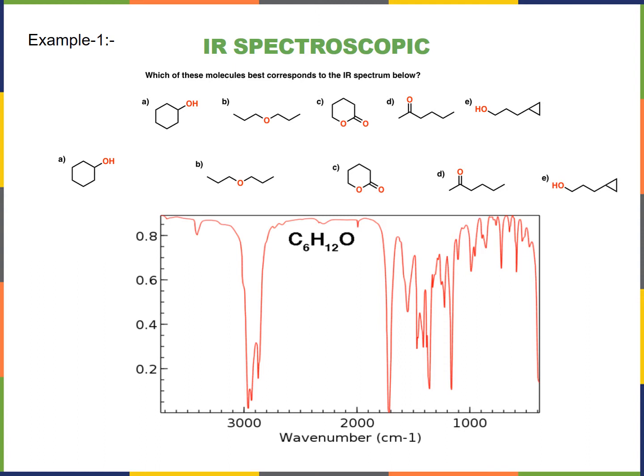Today's lesson is about infrared spectroscopy. Infrared spectroscopy is a spectroscopic technique used for structural elucidation or identification of organic compounds by their functional group. Now, there are different rules to characterize the infrared spectroscopy of a given organic compound. The following rules must be considered to identify the functional group of an organic compound using our instrument.